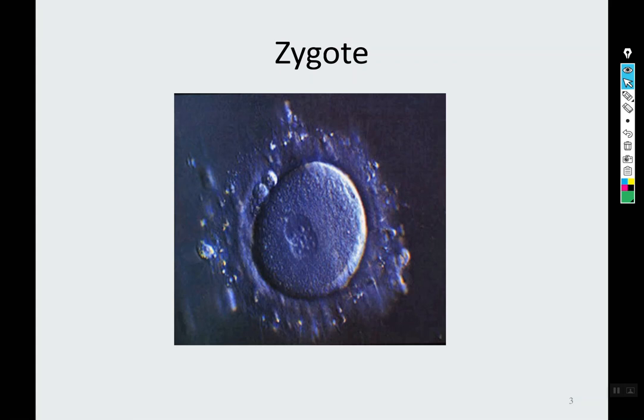So the result of fertilization is a zygote, which is the first cell of a new individual. And in this picture, you can even see, and this is really cool, some nuclear merging. It looks like a Venn diagram because that is the moment when two halves of DNA are busy combining. Pretty cool, huh?